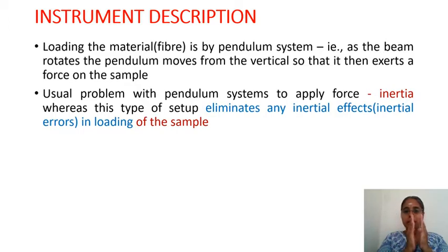So this beam moves, and there is a jaw which is held in the beam, and there is a jaw which is held in the pendulum. This setup moves because the beam pulls the pendulum via this fiber. The load is transferred along this fiber.